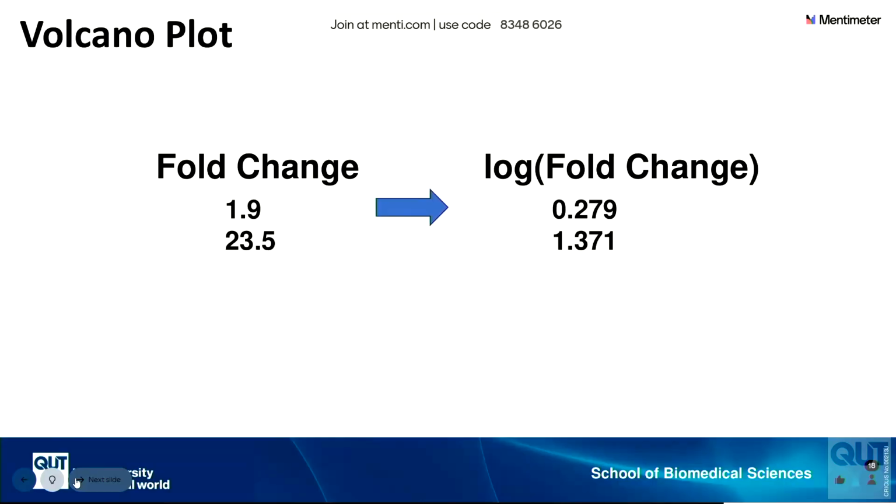So to make that easier to look at on a graph, you can take the log, which keeps it proportional in terms of how different it is. It just makes all the numbers smaller. So instead of it being 1 to 10,000, it might be 1 to 100 with still the proportional difference. So it's a lot easier to actually look at on a graph.